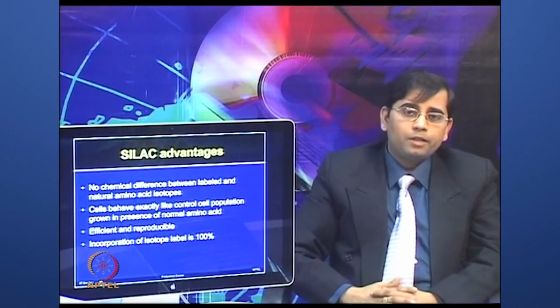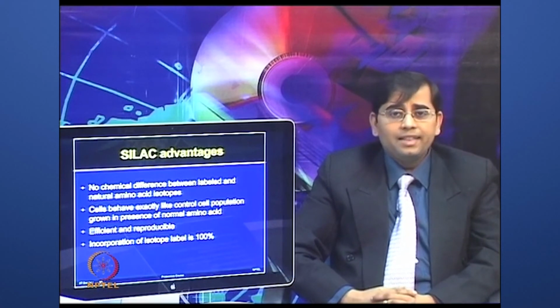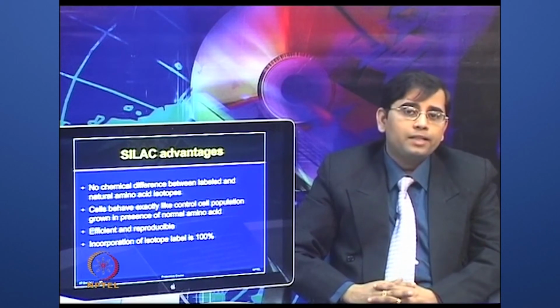So, let us discuss some of the advantages of using the SILAC method. In SILAC, no chemical difference is observed between the labeled and natural amino acid isotopes.